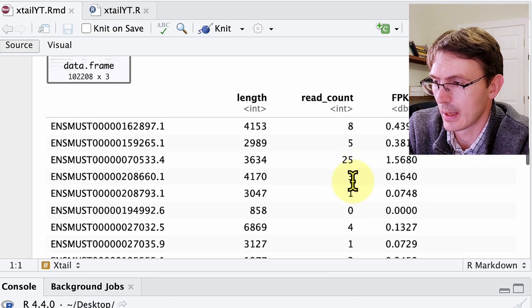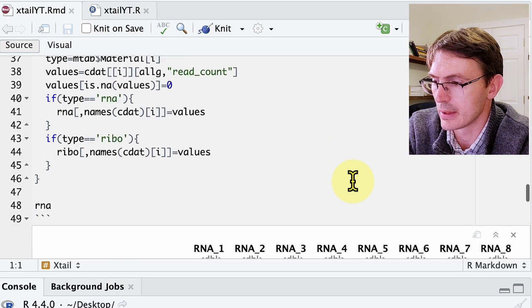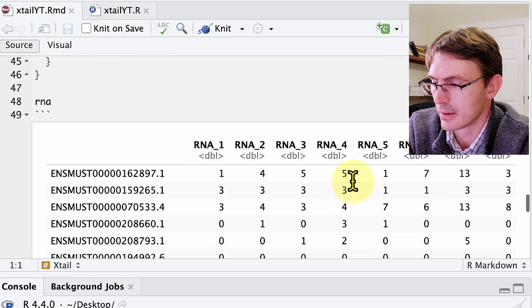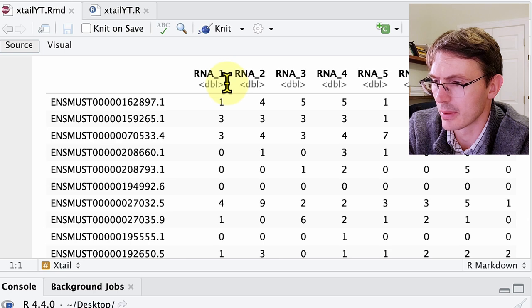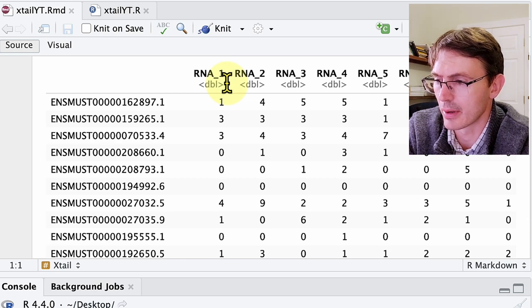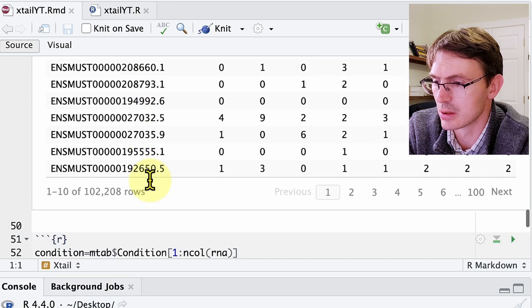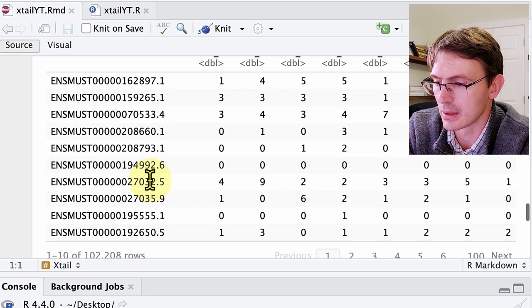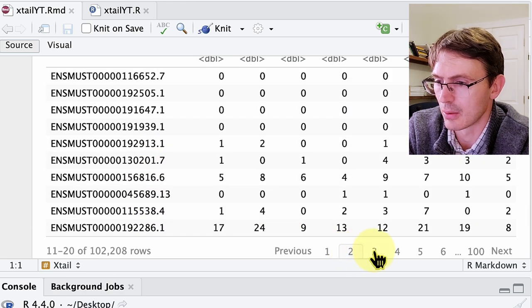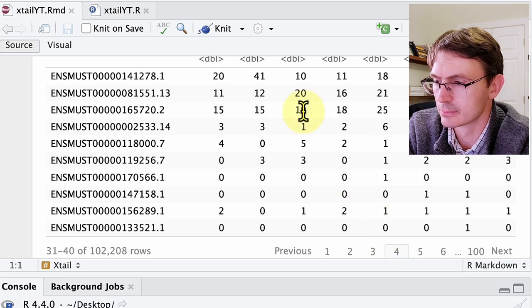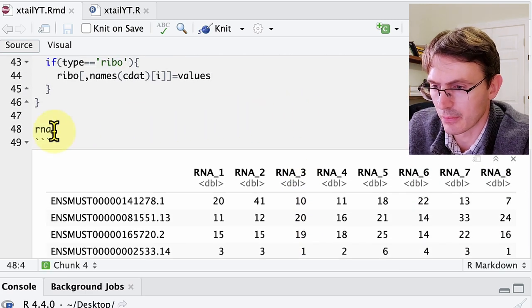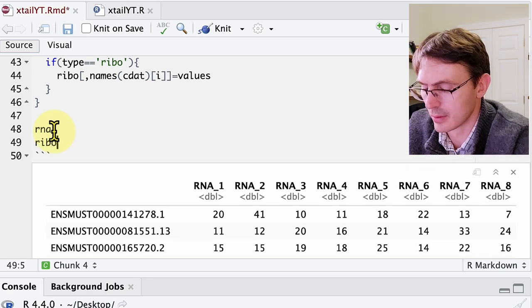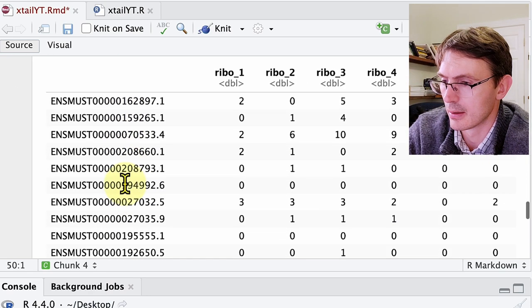After running the code, what we get is an RNA matrix where we have, for every RNA library, the number of reads mapped to each of the transcripts in the transcriptome — or at least those that were detectable. We also have the same for the ribosome footprint; if we run and ask for that ribosome library matrix, we get it as well.